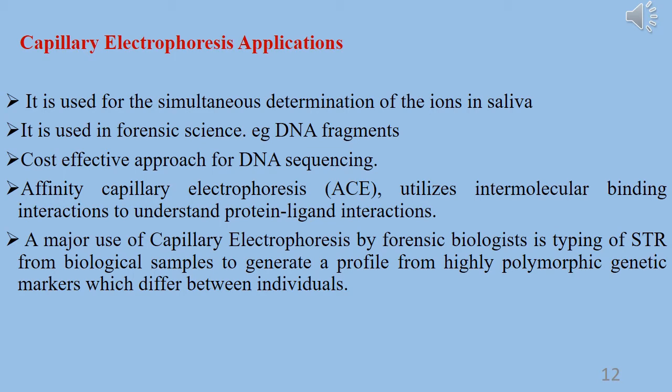It is used for intermolecular binding interactions to understand protein ligand interactions, and finally it is used by forensic biologists for typing of STR from biological samples to generate a profile from highly polymorphic genetic markers which differ between individuals.